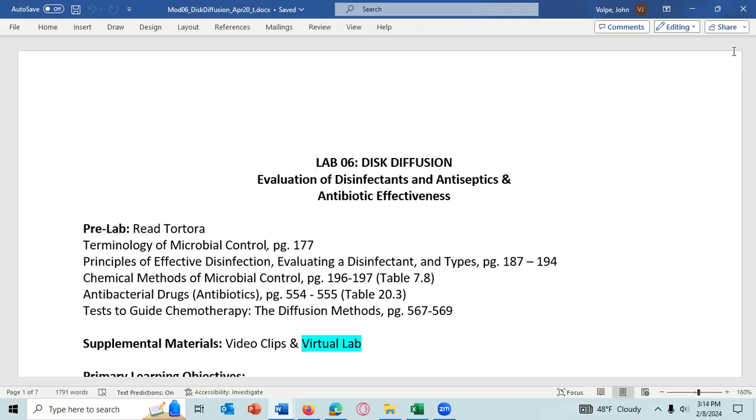It is a very good method for determining the resistance of cells to an antibiotic. And when clinicians are trying to determine whether a patient's bacteria cells are sensitive to one antibiotic, they'll run the Kirby-Bauer test on the bacteria that's causing the infection.